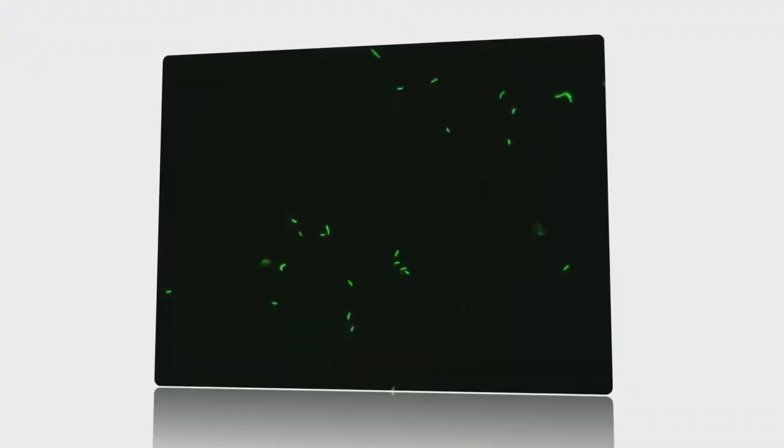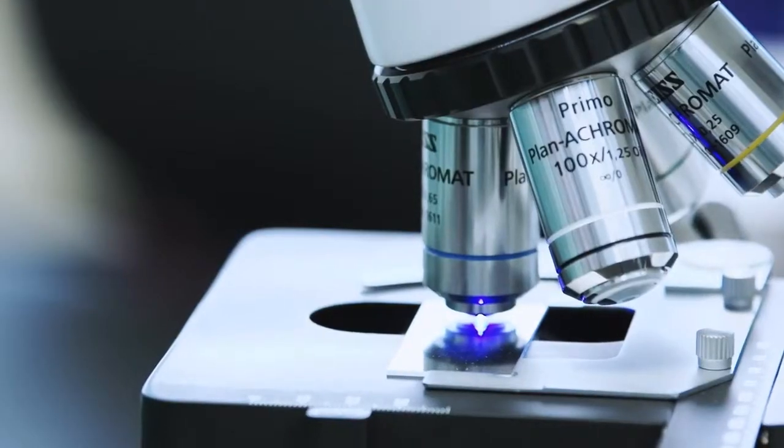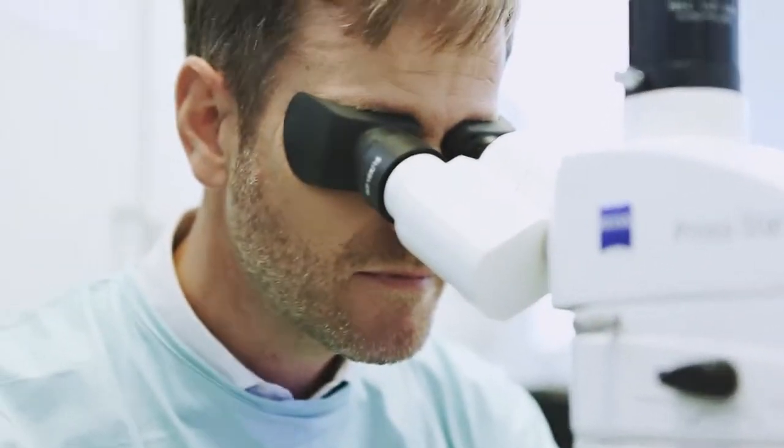You'll get a negative result if you don't find any acid-fast rods in at least 100 to 300 fields of view. Because fluorescence microscopy provides you with a particularly good contrast, you can identify samples very quickly indeed, effortlessly processing up to 50 preparations in one day.